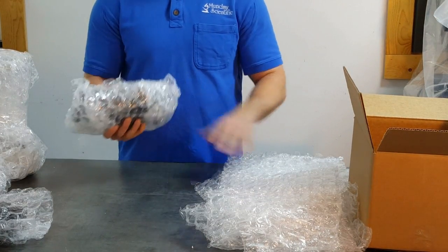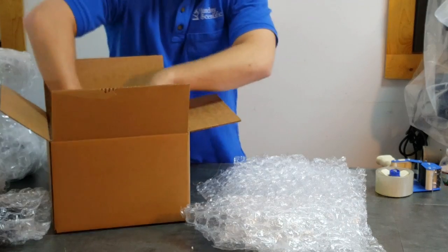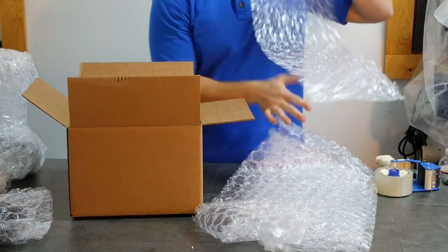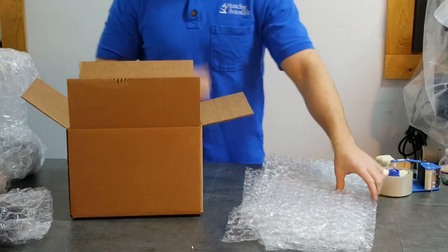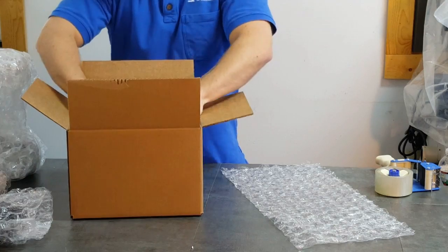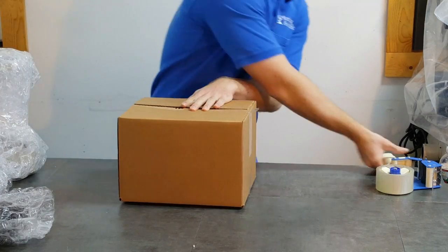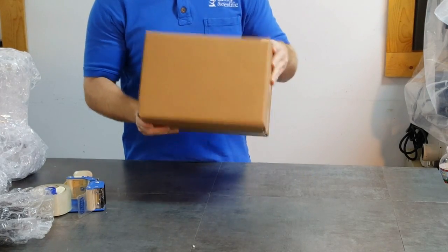You also want to double box the head. Again, a 12x10x8 is a very good box. Line the bottom with bubble wrap or foam, whatever you have available. Place the head in the box and secure with the rest of the bubble wrap. It's very important for all parts of the microscope when packing that you want them to not be moving during shipment. Once the box is full of bubble, close it up and tape it. Give it a little shake to make sure nothing's moving around in there.